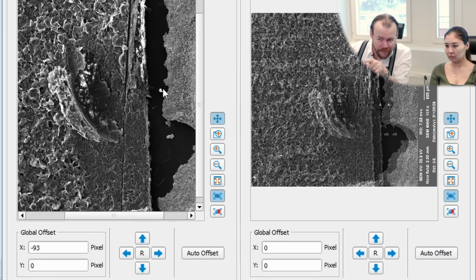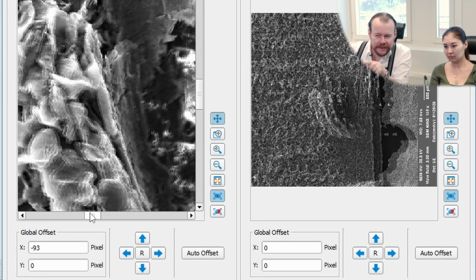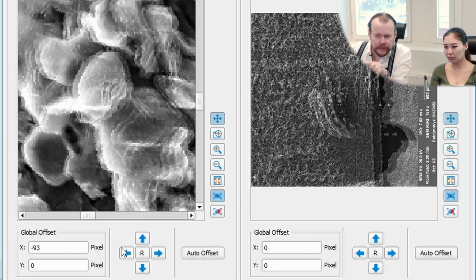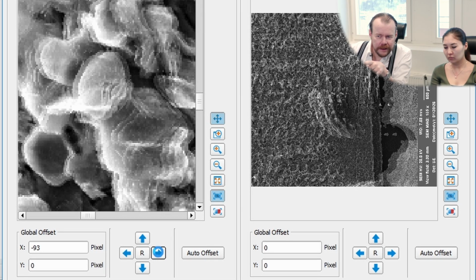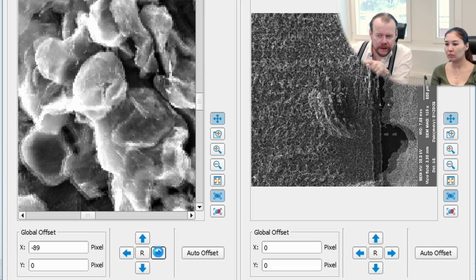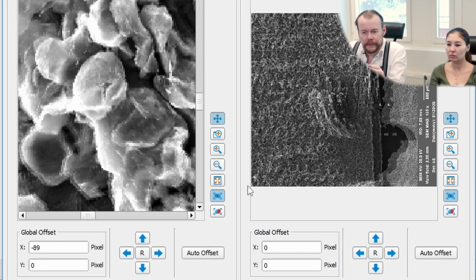Now we took the particle on the side. So let's say that it's this big feature here that is of interest. Then we would like to match actually over here. Okay. So if I click here, we can see that there is a little bit of change here. And the higher tilt angle we have, of course, the more severe this will be. So smaller features need higher tilt.